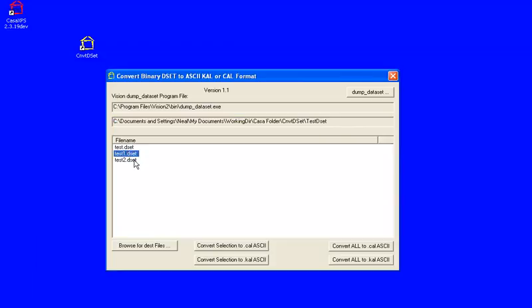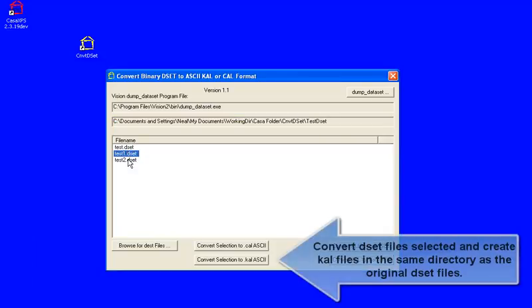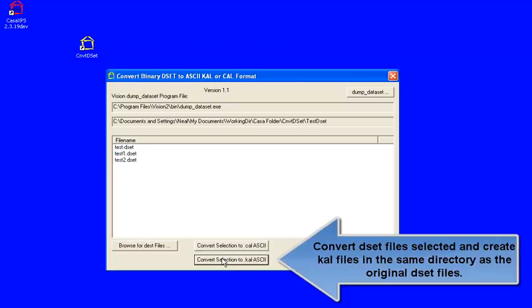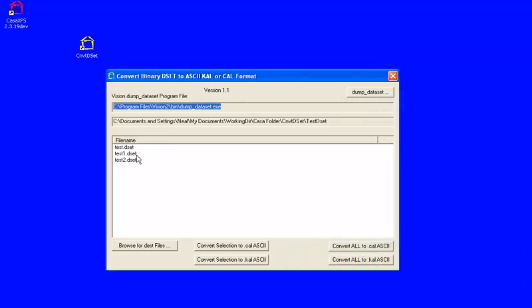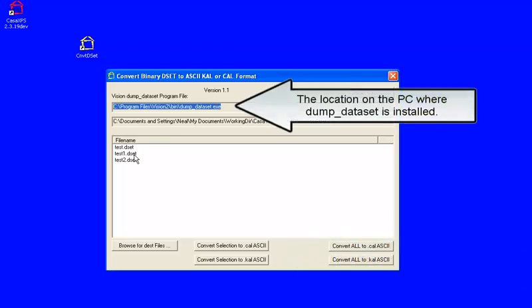If you select a pair of these holding the control key down to add to the selection, there's a button that says convert to CAL ASCII. What happens when you press this button is that the dump dataset program that is part of the Vision 2 installation is then used to process the DSET files and construct these CAL files.